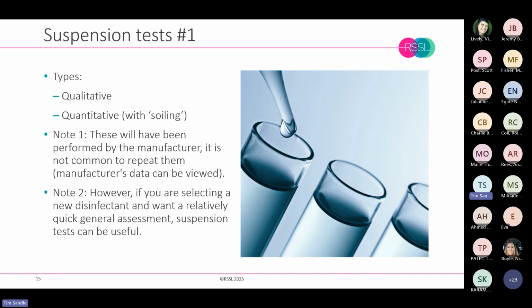And the reason they're of limited value is because it's not common for microorganisms to be in the planktonic state, or free floating. Most microorganisms, certainly within a clean room environment, are attached to a surface. And the longer a microorganism is attached to a surface, the harder it becomes to remove. And we may get added complications with biofilm formation. So it's a bit of an artificial construct, but it's a useful screening test.